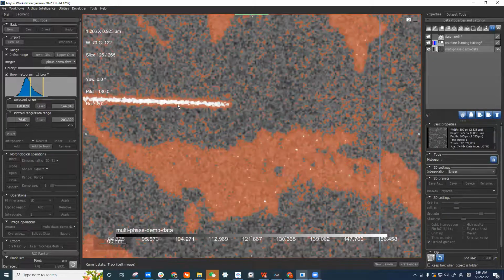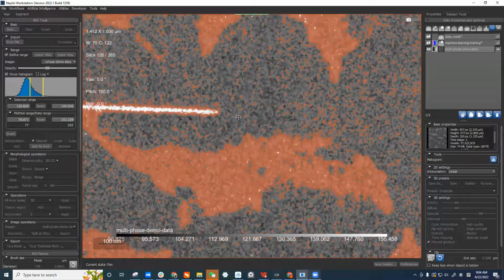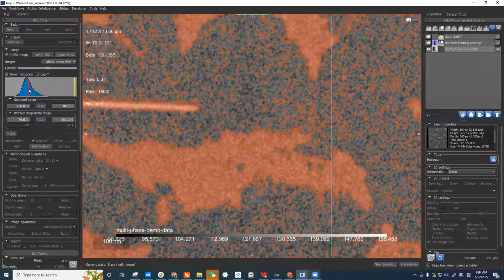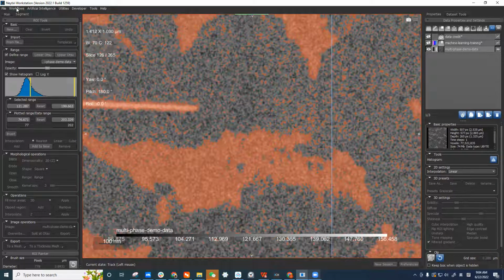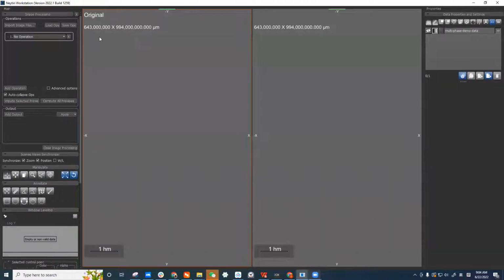You see the interface between the high intensity and the low intensity. The interface is medium intensity. So it's not possible to use the range tool or the thresholding tool on the original dataset to get the perfect segmentation. So the first thing we can think of is to do a filtering. For example, we can smooth or denoise the image. So we can go through that approach and see how it goes.